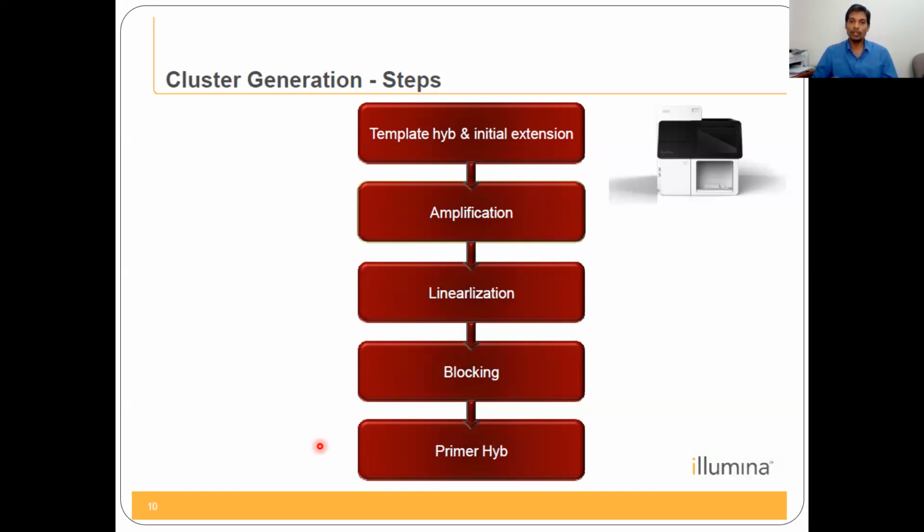Then you add primer sequences which are complementary to one of the strands, and you make both get annealed, because complementary sequences go and bind automatically. But at the elevated temperature of 96 or 100 degrees that is not feasible, so it will still be present as a single strand.